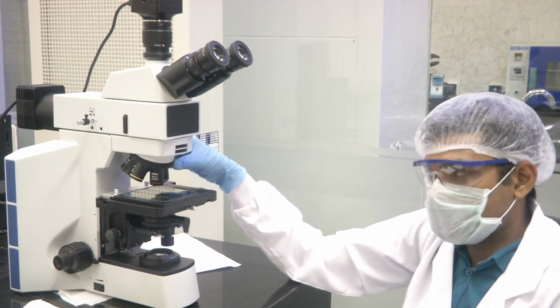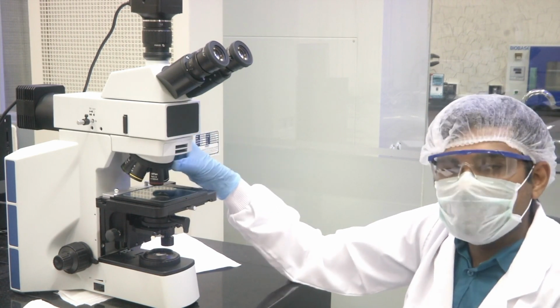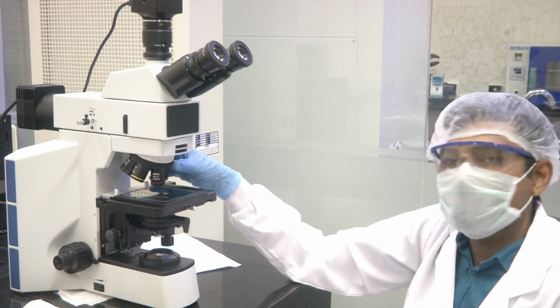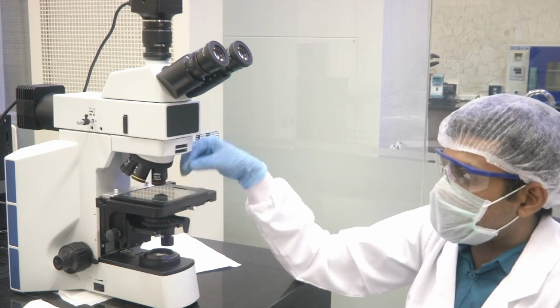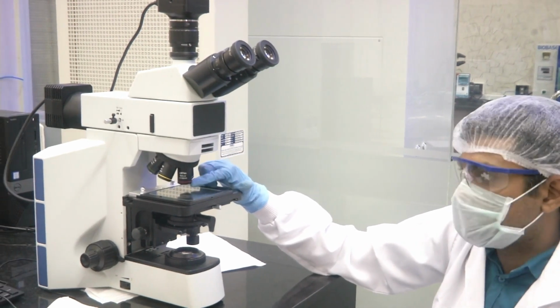Here in this microscope, or in any standard metallurgical microscope, the turret provides for multiple objectives connected to your eyepiece. So, the eyepiece is fixed with 10x magnification. Let us see. You see there is a red band here. This is one eyepiece, one objective, this is one lens.